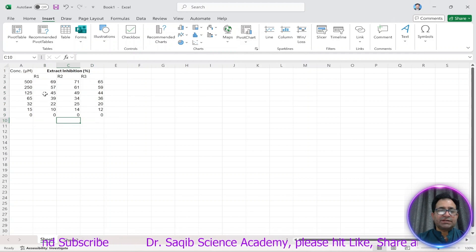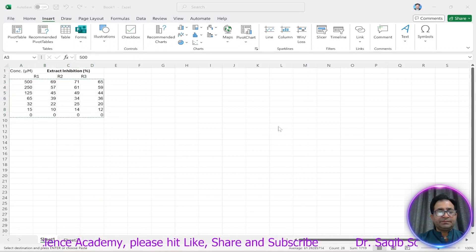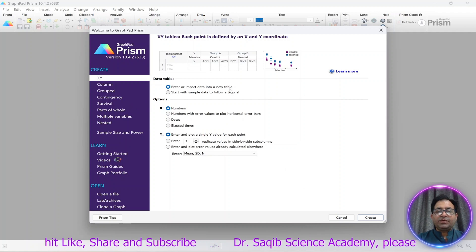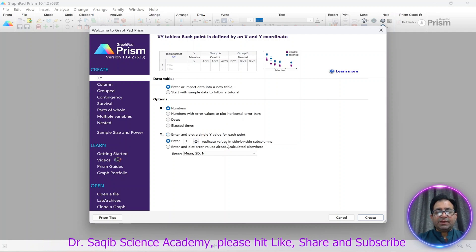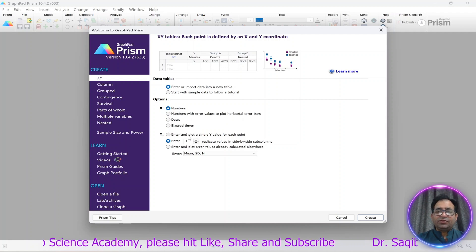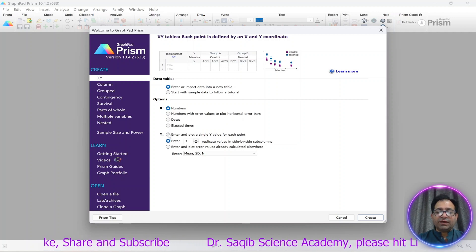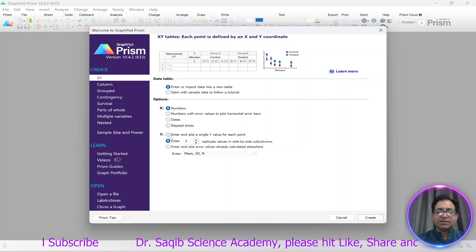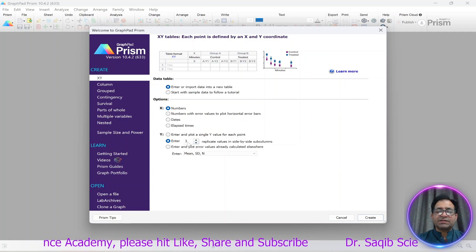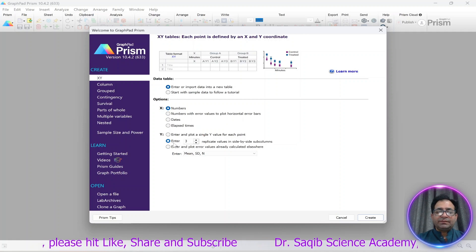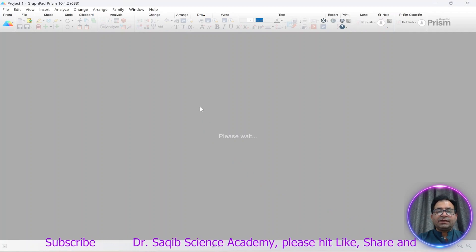We will determine the IC50 value using GraphPad. We will copy this data and open GraphPad, enter the data, and since we have three replicates we will select the three-replicate option. If there was a single Y value we would select the single option, but since we have three replicates we select accordingly. You can enter the number of replicates — two, three, four, or five. We will create this and then paste the data.